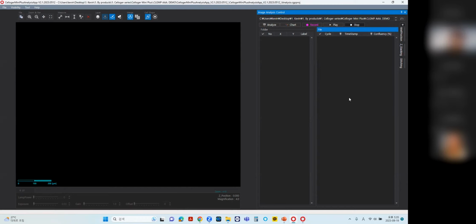And I think I forgot to mention, we also have a separate software, what we call an image converter. So once you obtain all the images downloaded from our scan software, if you run them on our analysis software, it'll process everything perfectly fine. But in cases of using ImageJ, you need different formats for each image. So what the image converter program does is convert our images into the specific setting that you require to run on your ImageJ.